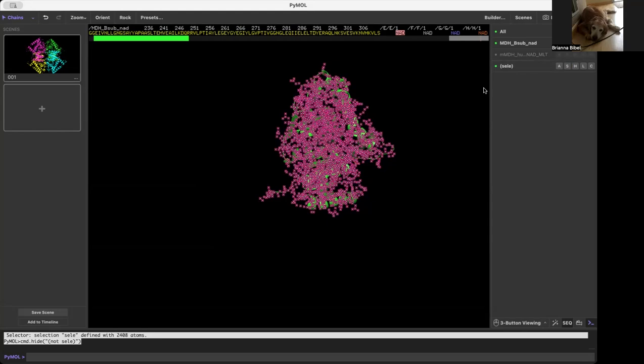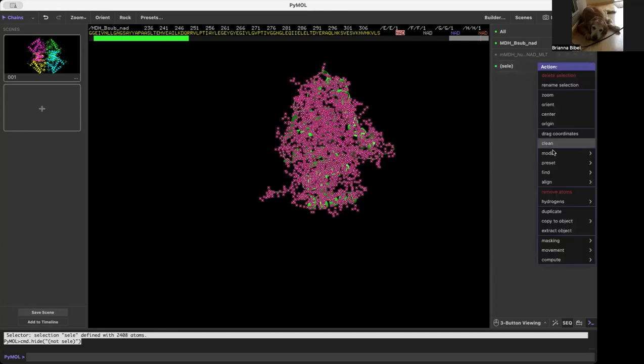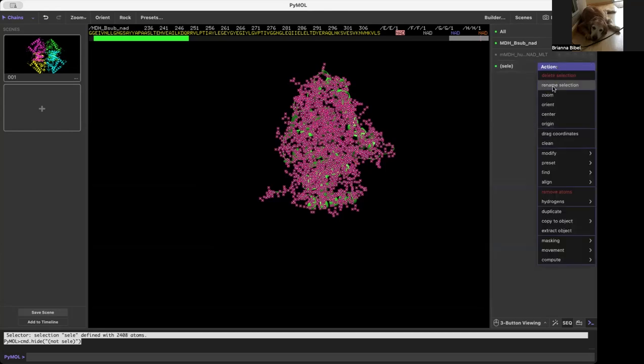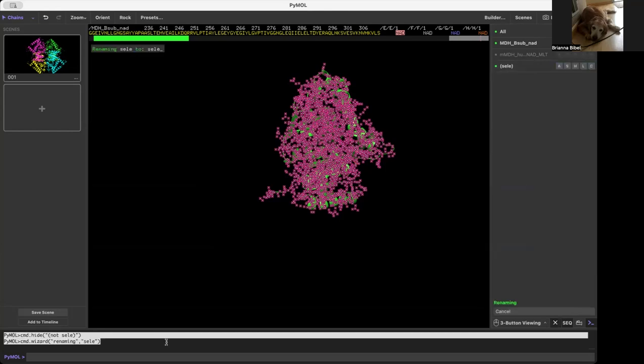But if you wanted to come back to the selection again, you would want to rename this as a new selection. You can either rename it here or in the command line.